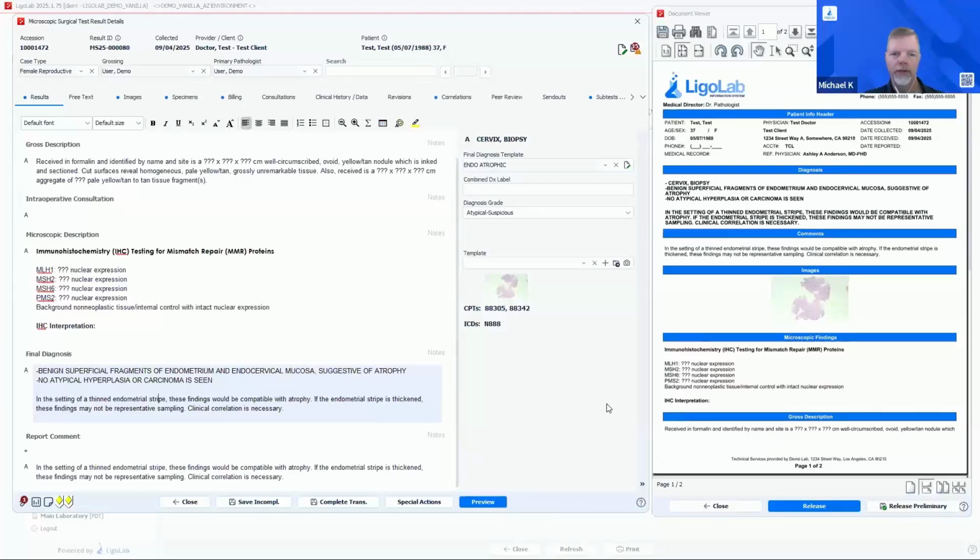All right. And another one: is there any automatic comparison of current pathology findings with patient history on file? If any exist for either correlation or discrepancies, are users alerted? Say there are any automatic comparisons. The pathologist can see the history. We can open this window to view the linked history with the specific patient.